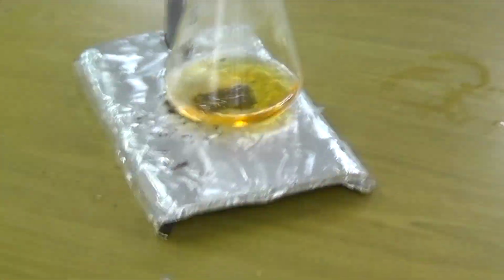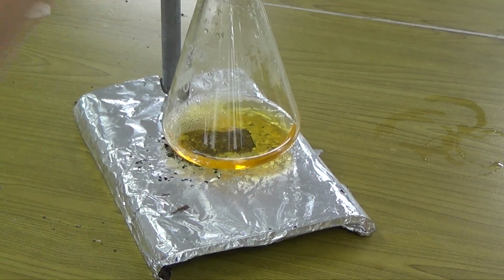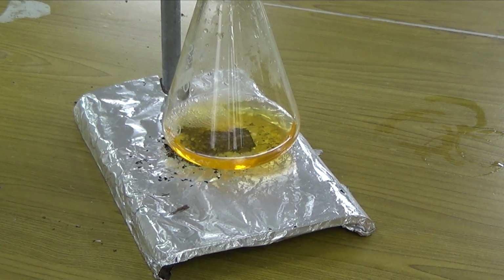So 22.8 plus 10.0 is 32.8. This time I don't need to slow down at 30, I can slow down at 32, because 32.8 is going to be 22.8 plus 10, which was my initial volume just now. So I should slow down maybe around 32.